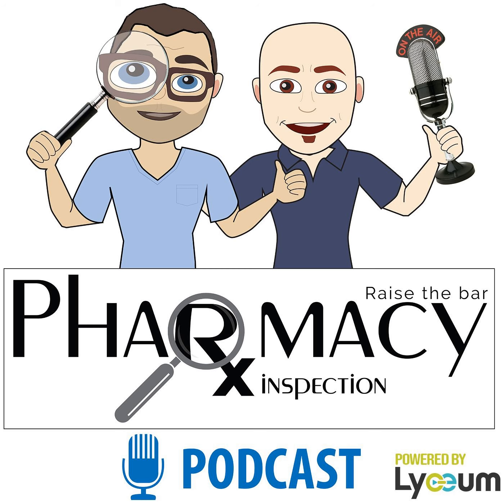USP 797 says data collected in response to corrective actions must be reviewed to confirm that actions taken have been effective. The corrective action plan must be dependent on the CFU count and the microorganisms recovered. Some examples of corrective action include process or facility improvements, personnel training, cleaning and disinfecting, or HEPA filter replacement and/or repair. The extent of the investigation should be consistent with the deviation and should include an evaluation of trends. The corrective action plan must be documented. Again, this is found in USP 797, data evaluation and action levels.